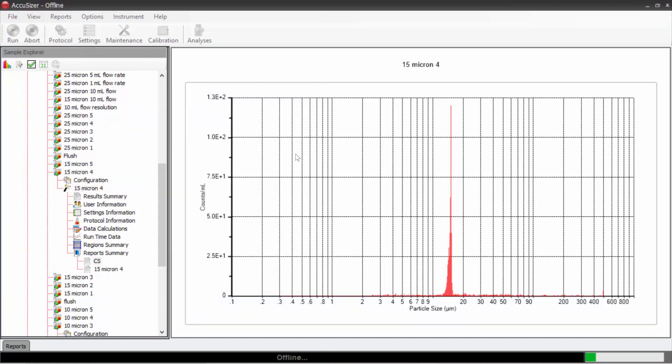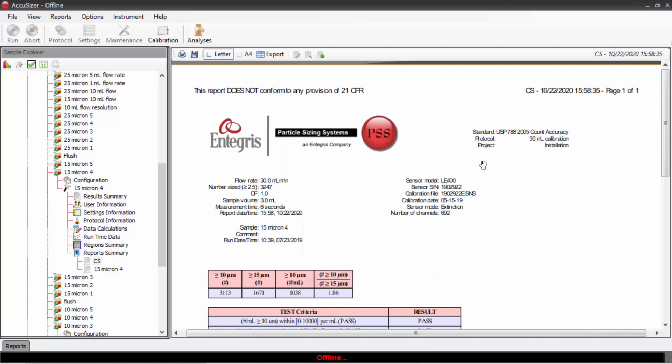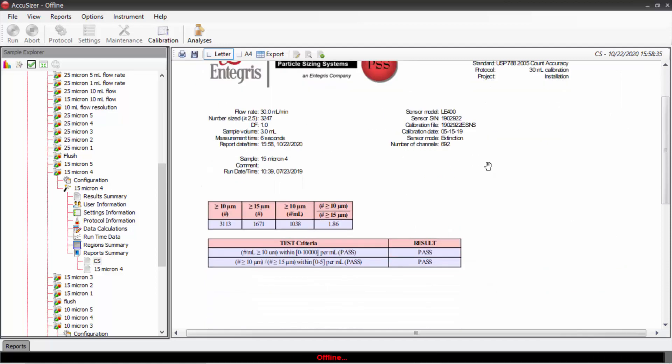And now it will automatically generate the count standard report as we see here. It is in between the minimum and the maximum. And the ratio of greater than 10 to greater than 15 microns is 1.86. That's acceptable. So this measurement passes both the count criteria and the ratio criteria.